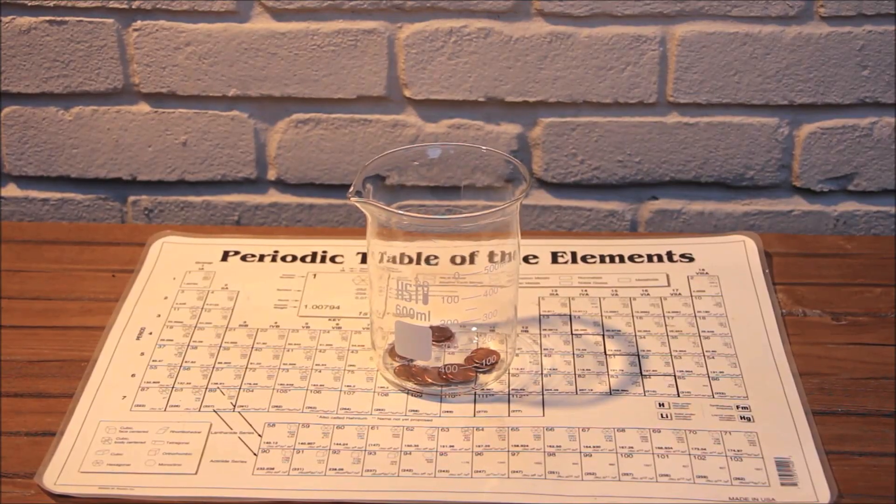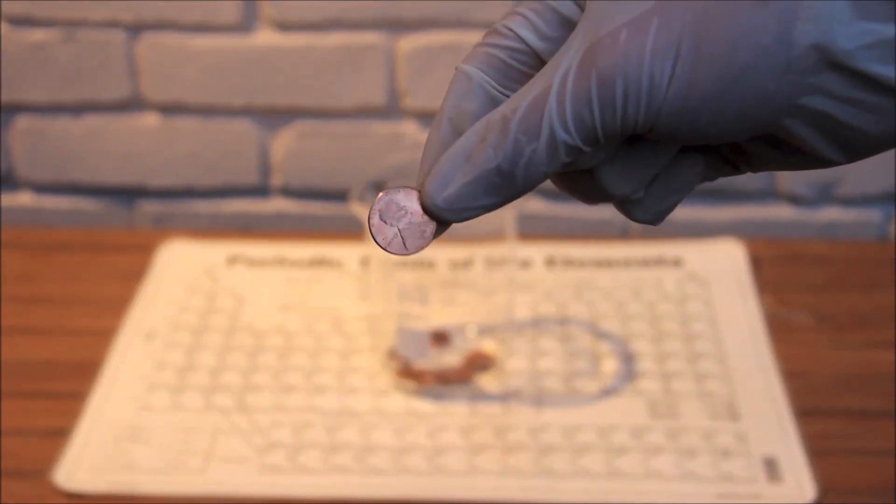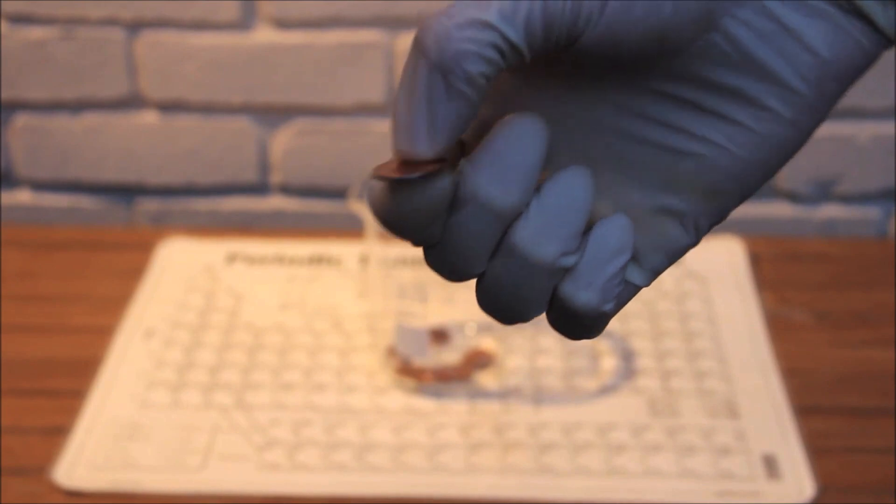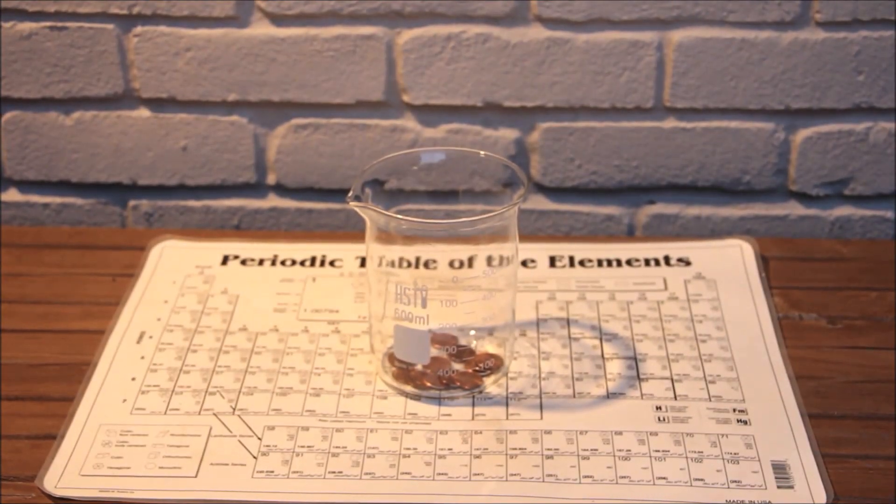For this experiment, you will need post-1982 pennies because they contain a zinc core. Here you can see that this penny has a zinc core, which is visible since I sanded the outer layer of copper around the rim of the penny. Be sure to sand off a small layer of copper on each penny to expose the zinc underneath.